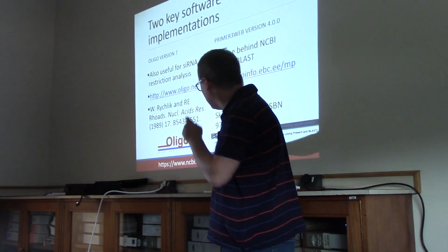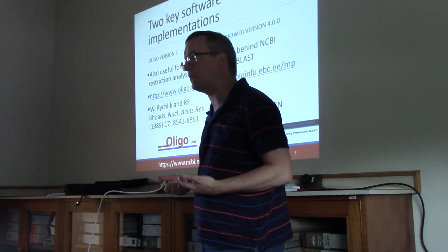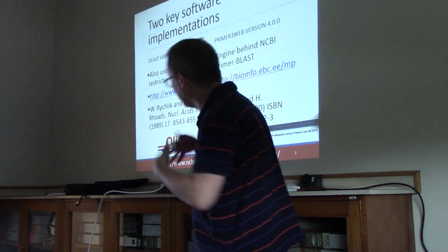So I hope that the video for Oligo 7 can help illustrate some of the features we can deduce about our primers in that video.